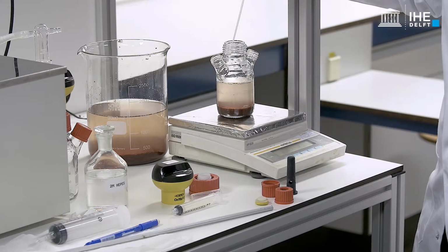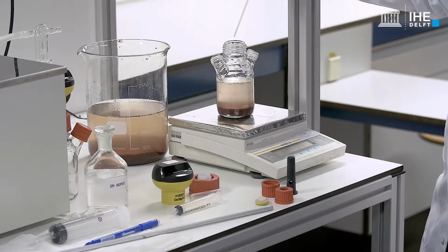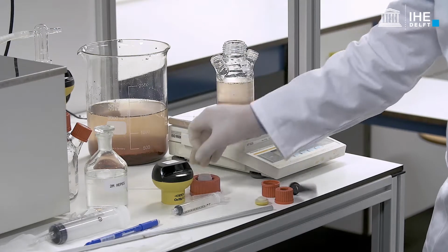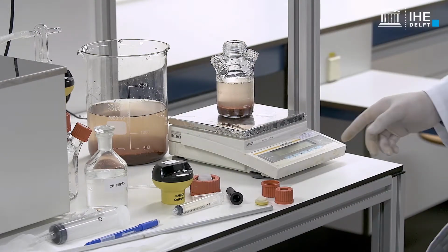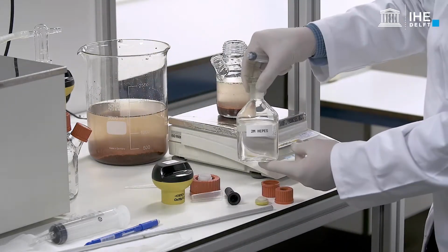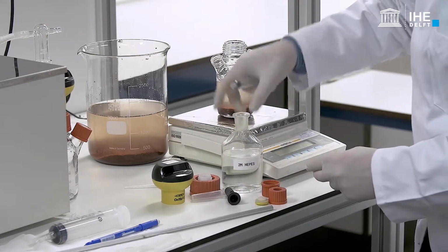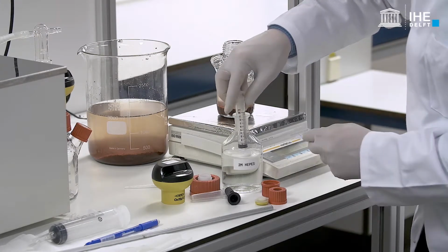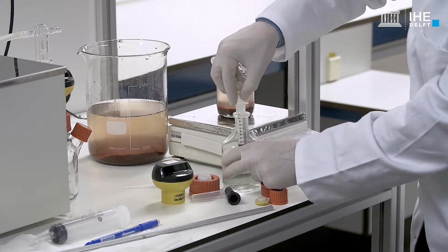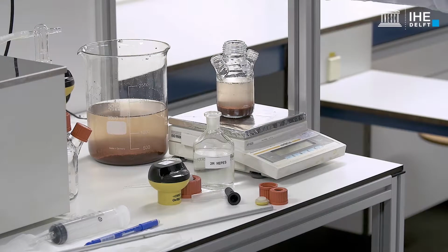If, as usual, the apparatus for the manometric measurements does not have a pH control system, then a pH buffer solution, e.g. Hepes, 25 millimoles, may be dosed to the sludge sample, and the pH set to the desired value, for example pH 7.5, according to the recommendations reported in section 2.4.3.5 of the textbook. In this example, a concentrated solution of Hepes, 2 moles, at pH 7.5 was used by dosing 2.5 millilitres to the mixed liquor in each batch reactor, in order to reach a final Hepes concentration of 25 millimoles.